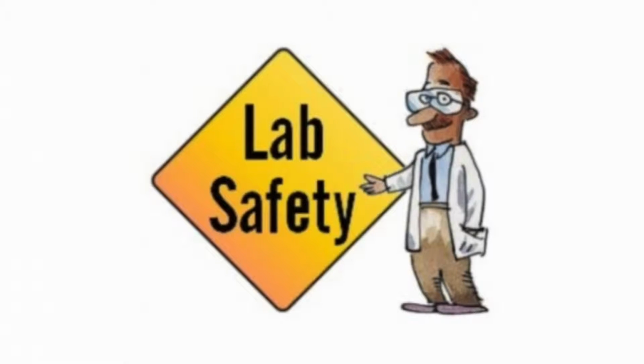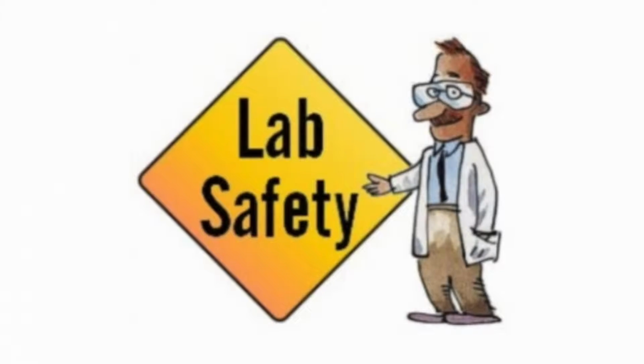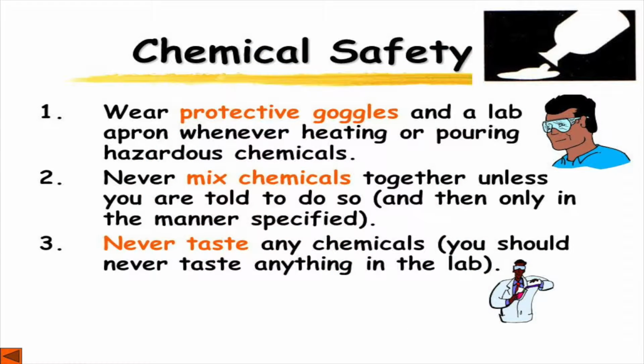Before we begin the video of our experiment, we first need to address a few safety concerns in order to have a successful and safe experiment. This video contains a variety of chemicals which can be harmful if they are not treated correctly and with safety. This is why we must wear goggles at all times while doing this experiment in order to prevent any eye injury that these chemicals might cause.